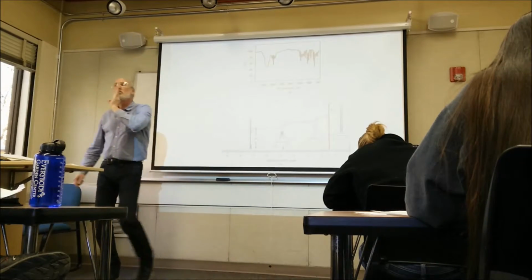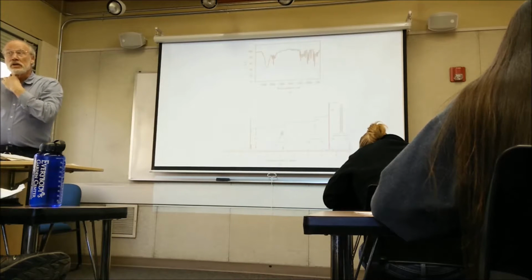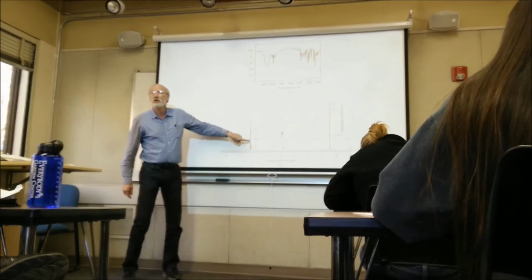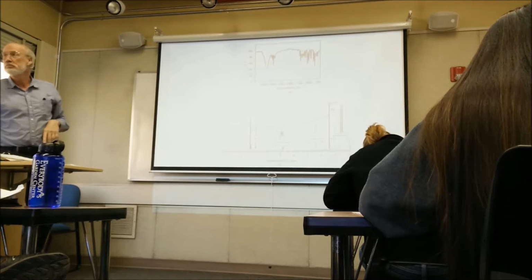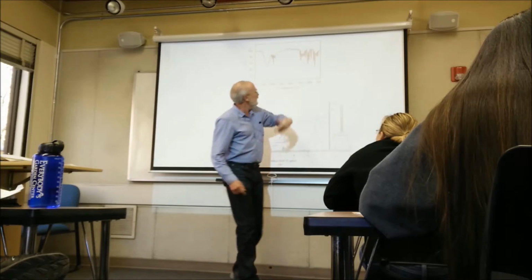What does that tell you? It's a ring. And what do you know about the ring if there are 5 hydrogens under this benzene ring peak? It's mono-substituted. That would be this thing right here, and there's going to be another one up there.